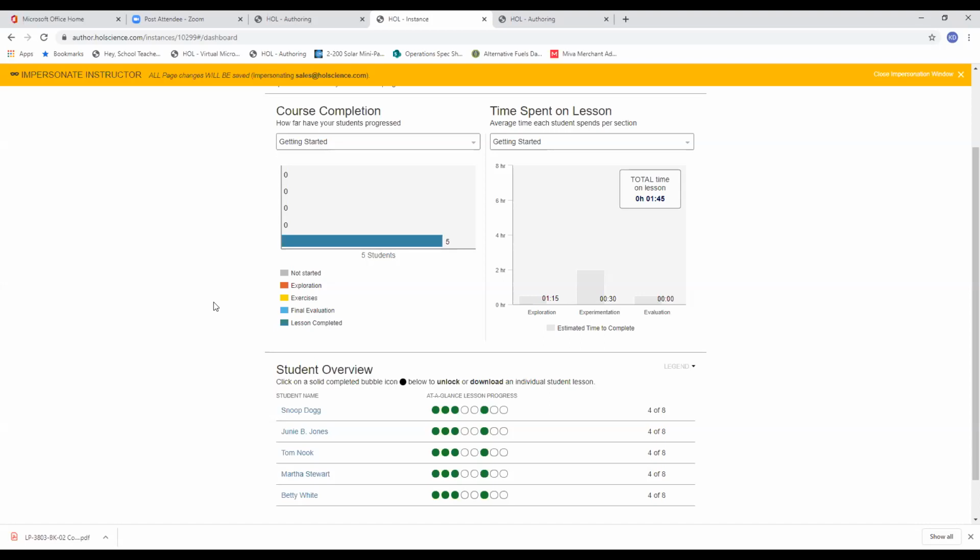We've received multiple inquiries regarding the student's safety and liability, a lot of which were geared towards the student's handling of the urine and blood samples. Could you go into a bit further detail for us today, Dr. D? Well, students are only handling their own urine and blood samples, first of all.